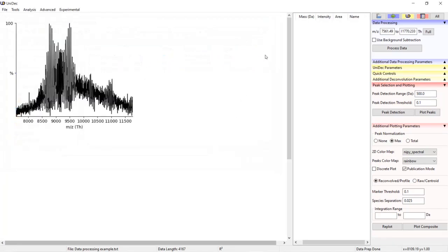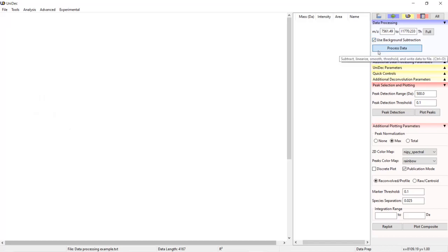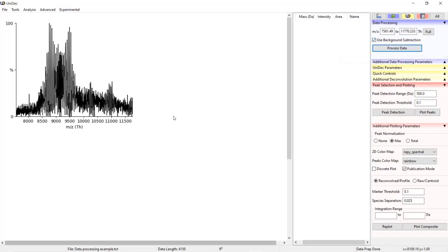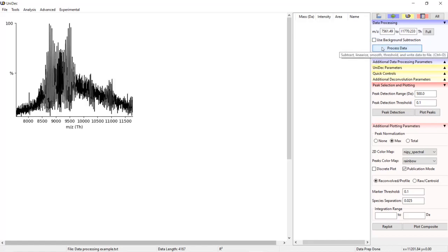If we look back to the M over Z range, we see that there's a very simple way to background subtract the data. If we click this and look at our spectrum and hit process data, UniDec will automatically subtract the background. If we click off the background subtraction button and hit process, it will no longer use the background subtraction.